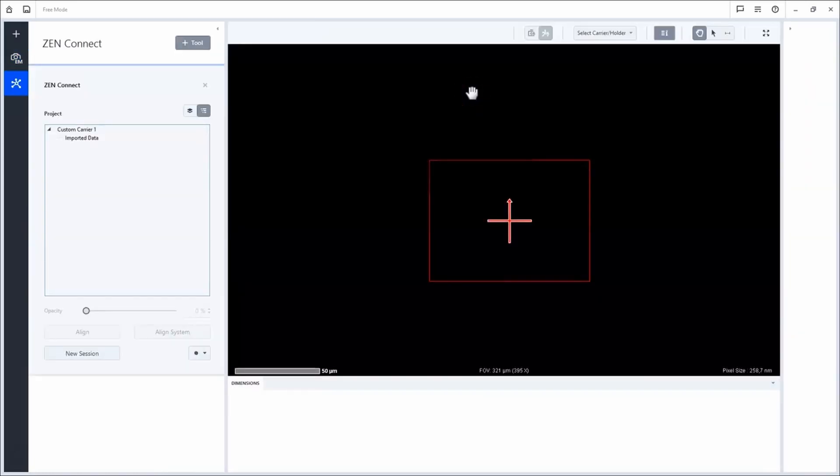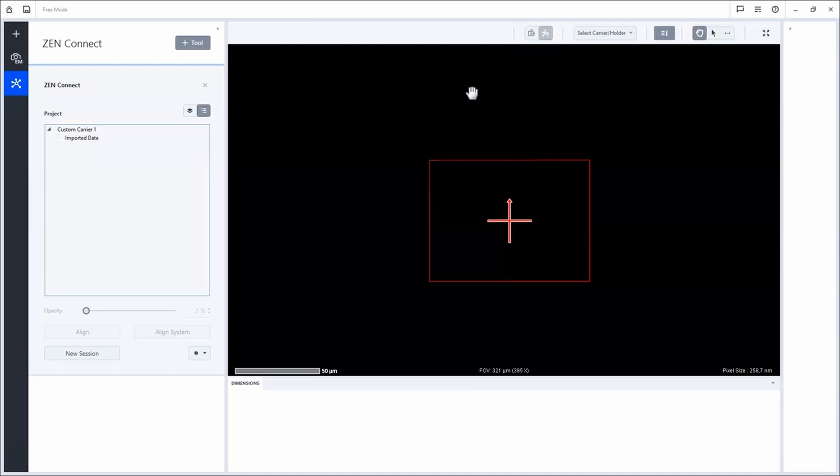The XenConnect workbench has several functionalities that I will show you now. Let's start with an overview of the different parts of the workbench.